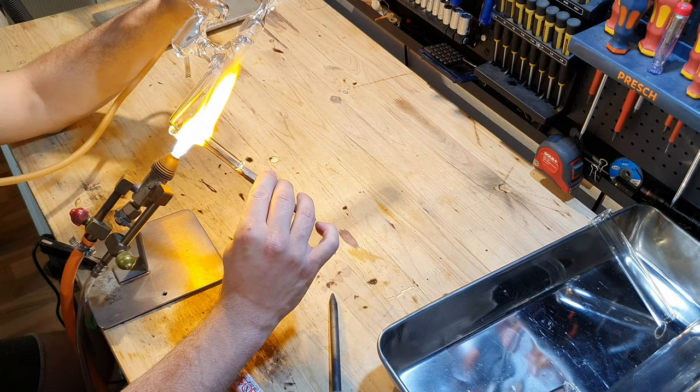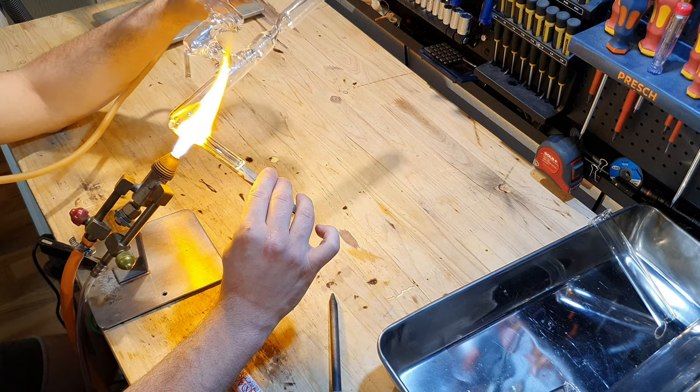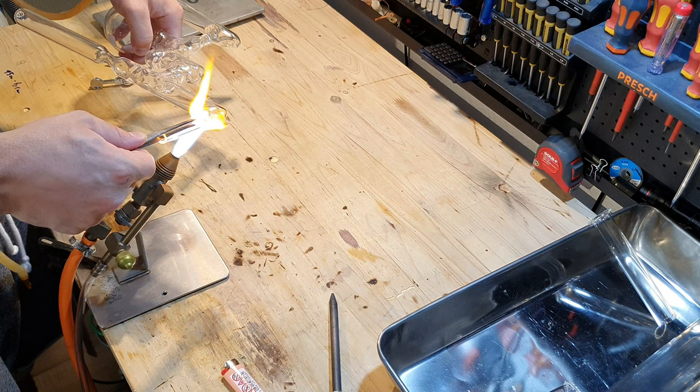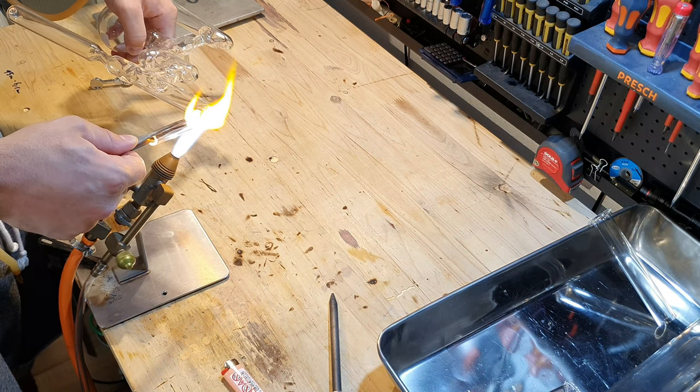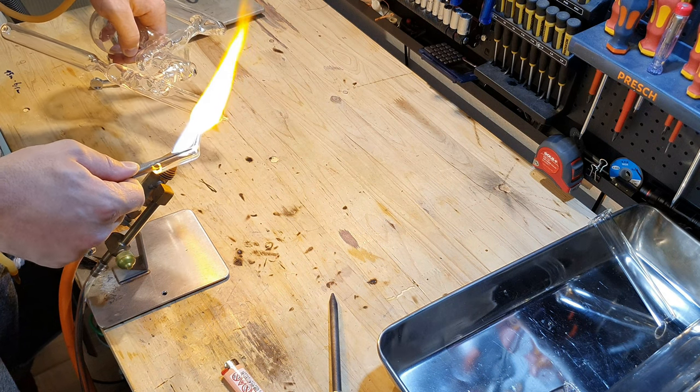This video is about flameworking only, so it might be boring for some of you. But since I spent many hours making this custom glassware, I thought I would show you some of my work. I am not a professional and my creations look accordingly. But you only get better by trying, so here you can watch me trying.